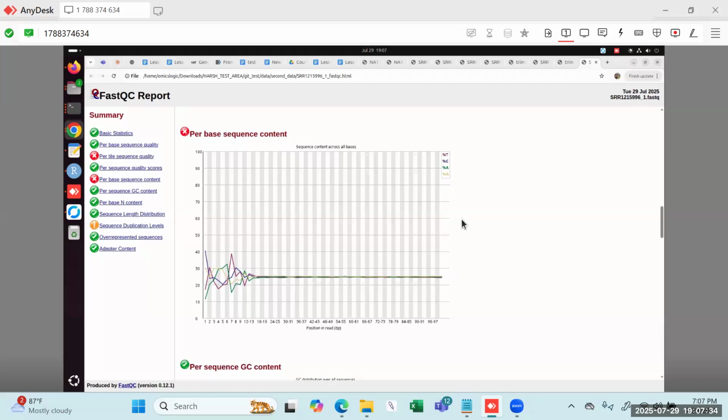So when we perform the trimming process, there are chances that the ones in the red zone either move to the orange region, which is a warning zone but is acceptable, and sometimes they move towards the green zone also.